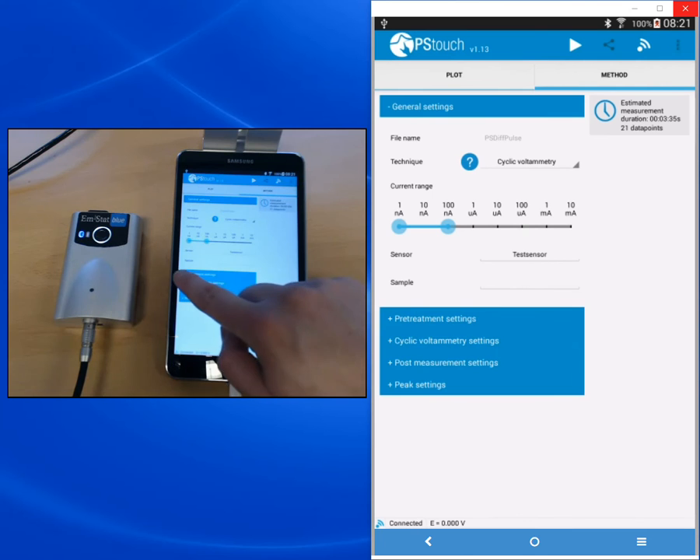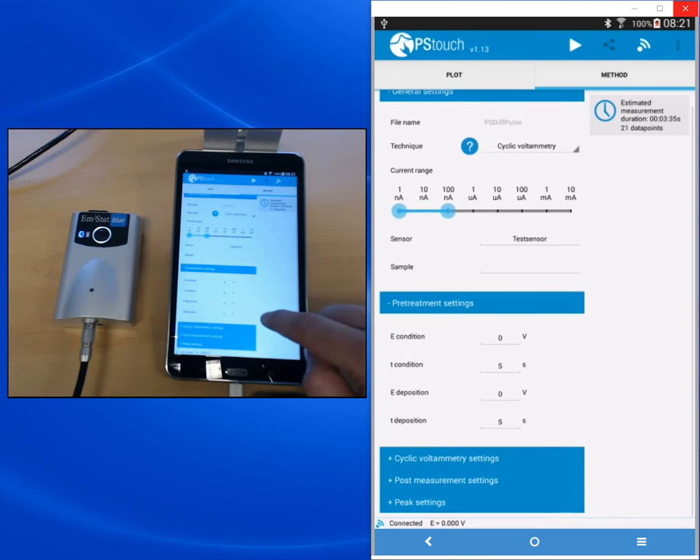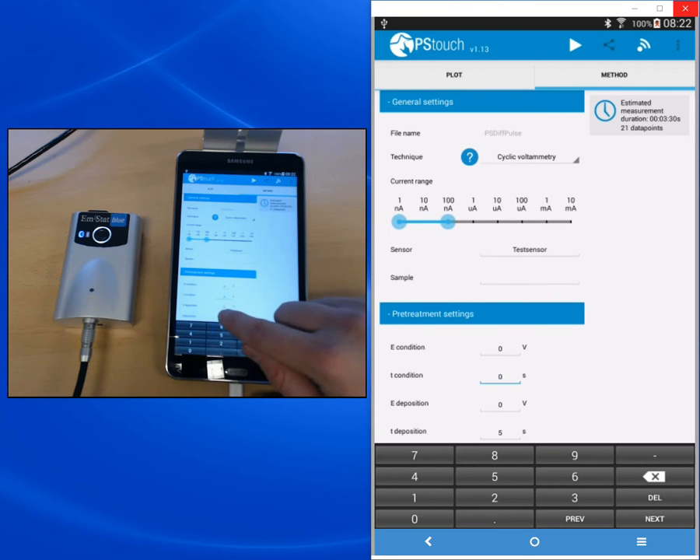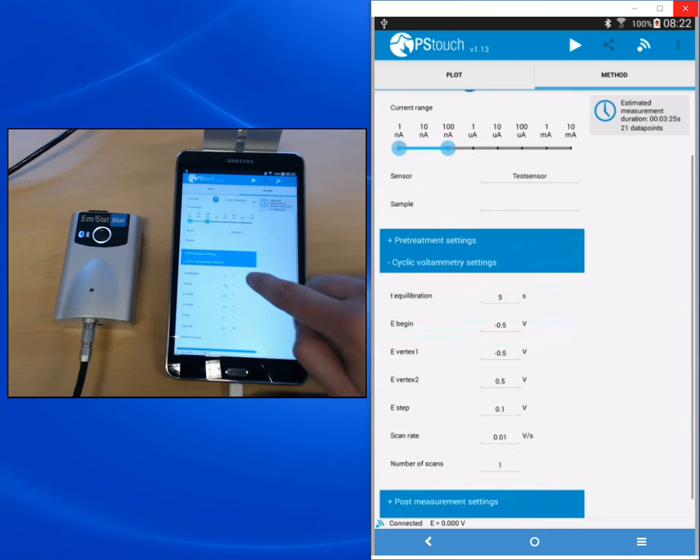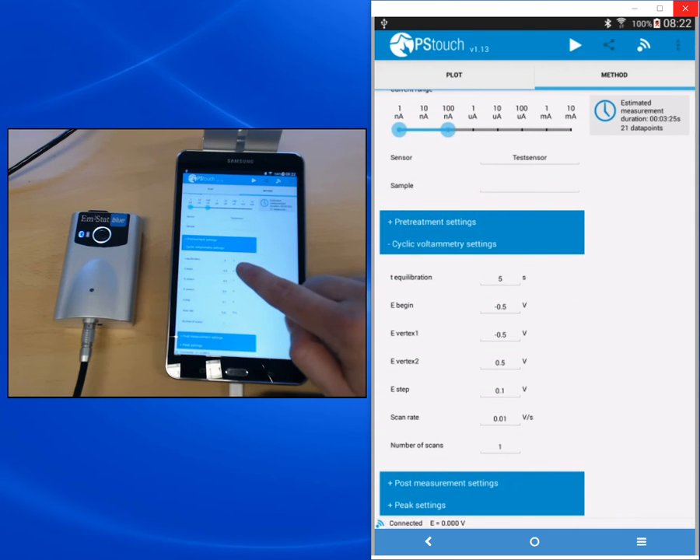The next section is the pre-treatment settings. We don't need a pre-treatment for this experiment, so we will set the time to zero for T condition and T deposition. The pre-treatment allows you to apply a potential before the measurement starts, which is useful if your electrode needs to be conditioned or for stripping voltammetry. Since we don't need that, we set these times to zero and this step will be skipped. The next section is the settings for cyclic voltammetry. T-equilibration is 5 seconds — that's fine.